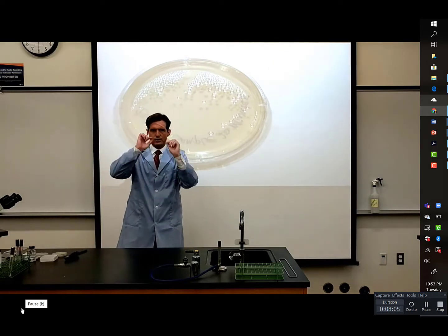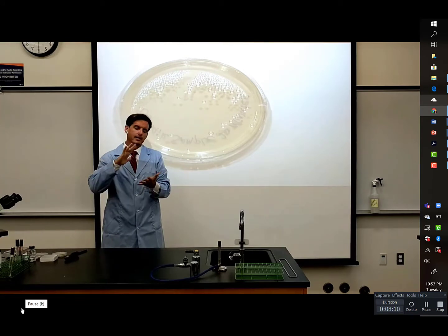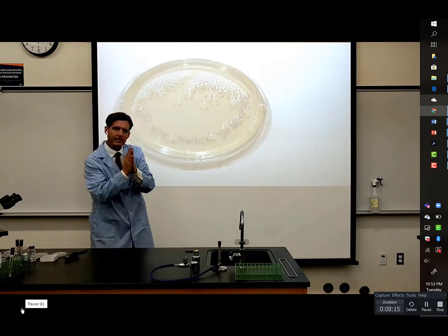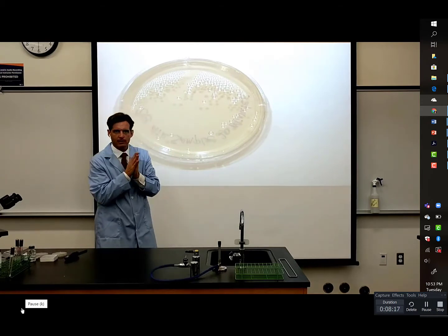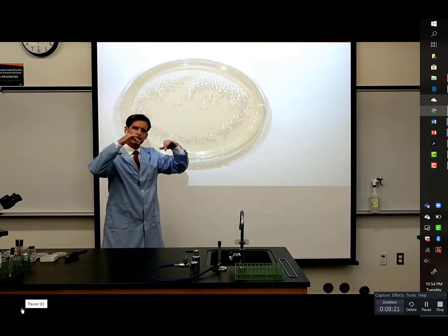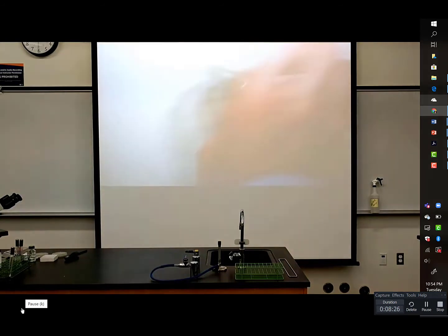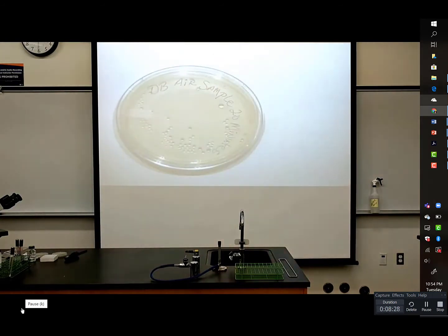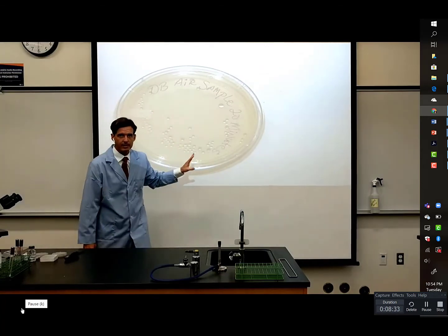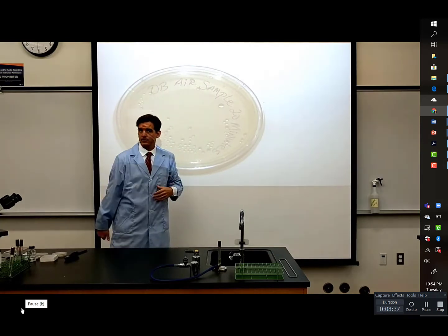They're little notches on the underside of the Petri plate lid, and what it does is it keeps these Petri plates from sandwiching to an airtight seal. They do not seal shut. This plate actually has room for gas exchange, and so when we flip the plate over like this, gas will be able to escape, water will not build up underneath the lid, and it's nice that we can see our label facing up as well.